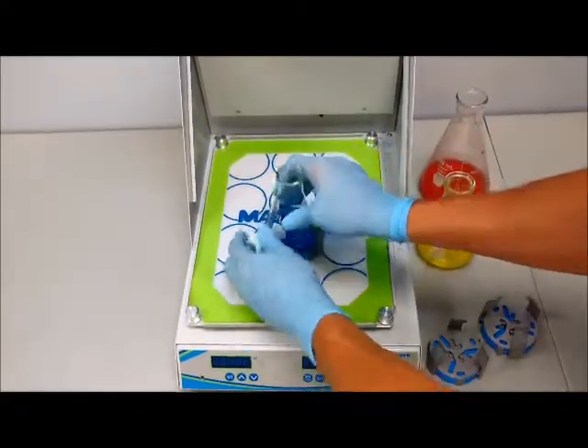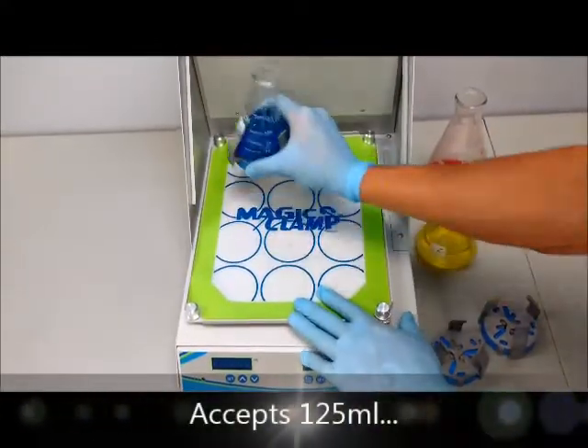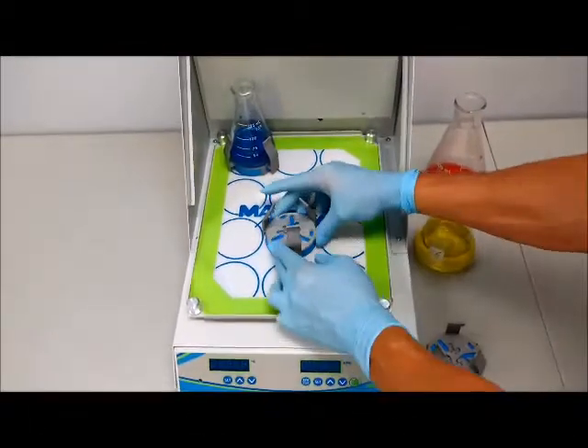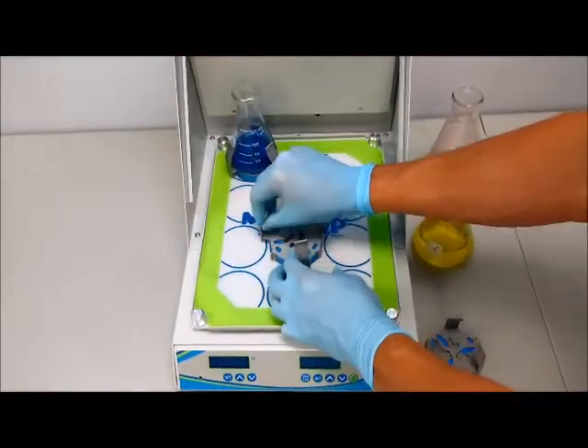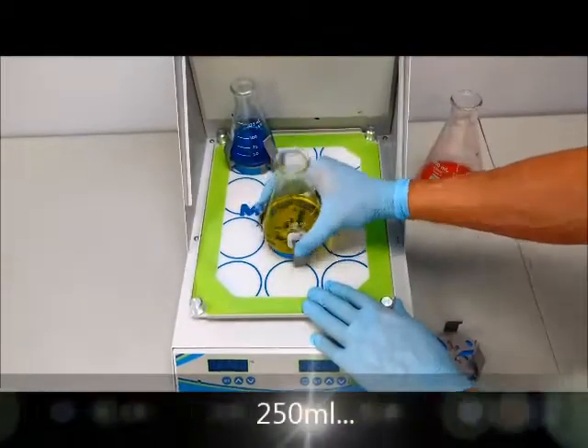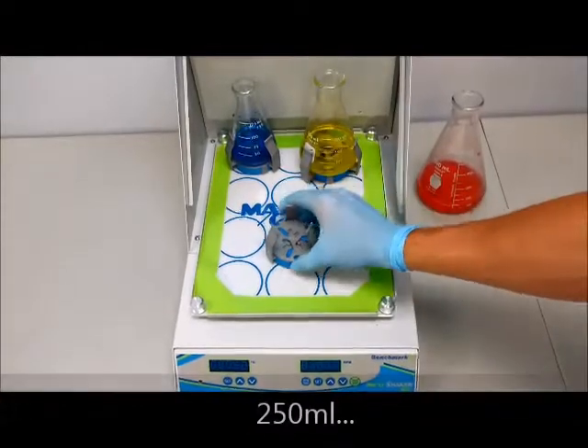In addition to our traditional clamps that are dedicated to a specific size of Erlenmeyer flask, Benchmark also offers the only adjustable clamp, capable of securing 125 ml, 250 ml, and 500 ml Erlenmeyer flasks.